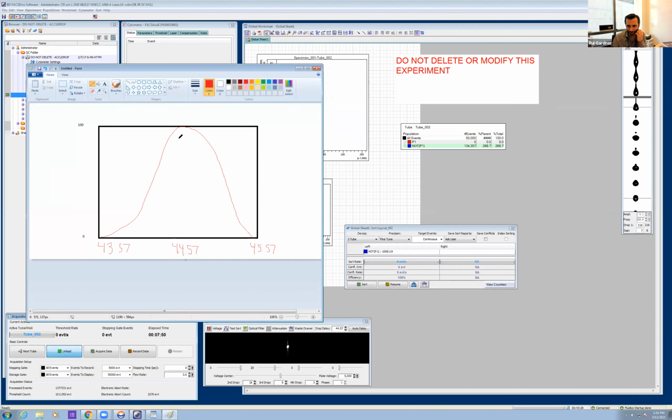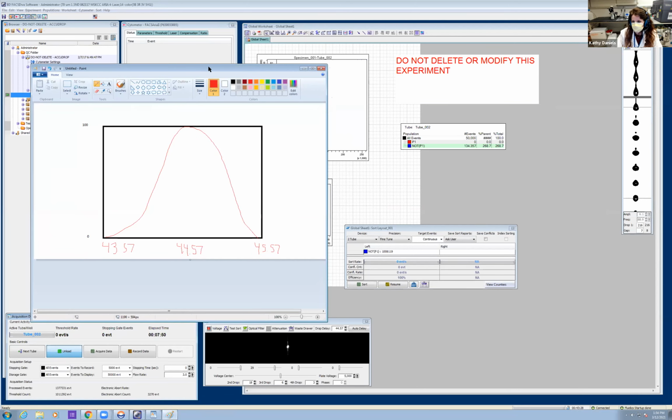Okay, so we have a lot of questions coming up, and I'll let some of you answer these. Do you always set the drop charge delay manually? Yeah. What we typically tend to do is we always set it manually so that we can see if there are any minor issues. There is an automatic delay that takes a bit longer, and that is something that you can do, but we like to train people to do it manually.